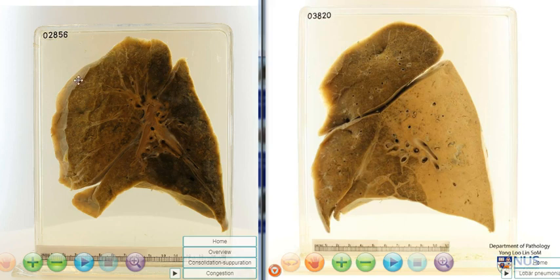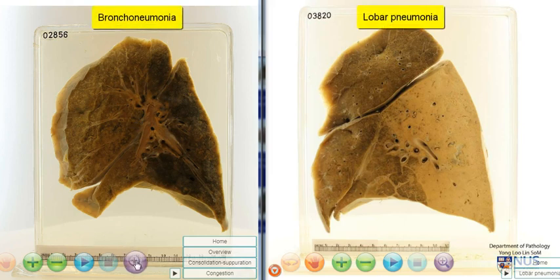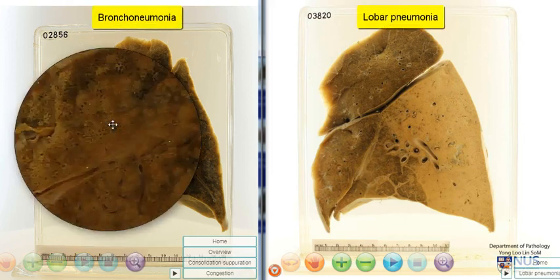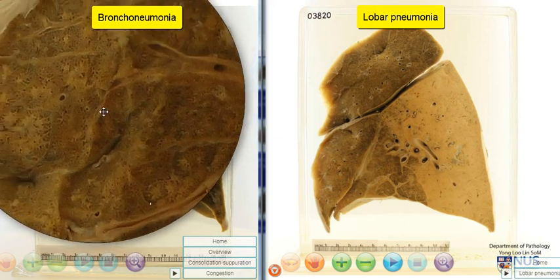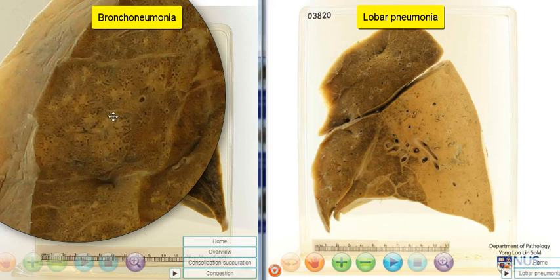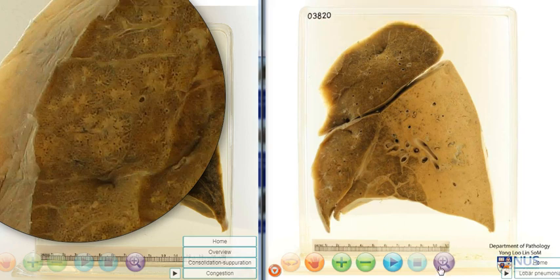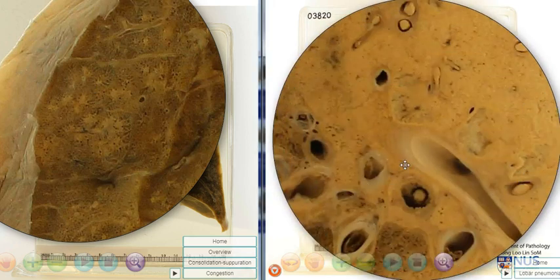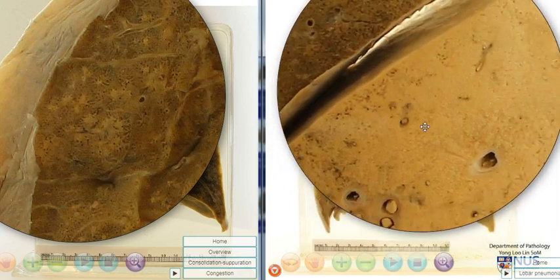On this left side, I have the cut surface of a lung specimen which is involved by bronchopneumonia. We can see here that there is some patchy consolidation. These are the paler areas seen, with a bit more normal-looking lung parenchyma in between. And let's just have a direct comparison with the lobar pneumonia, where the entire area looks solidified.